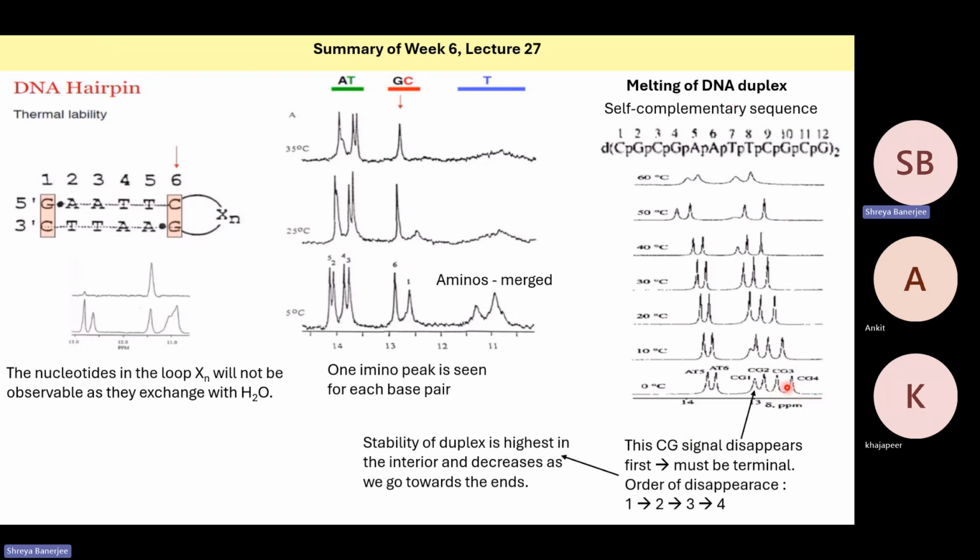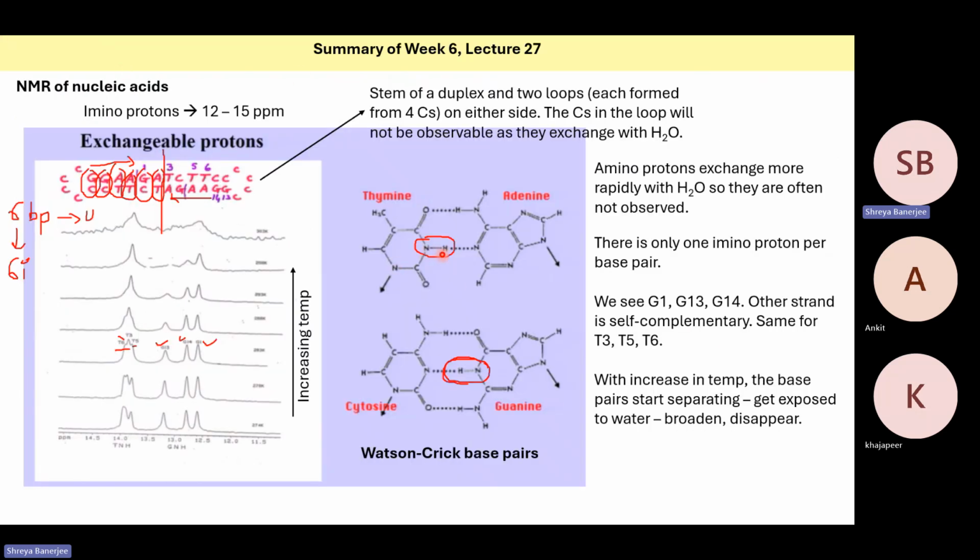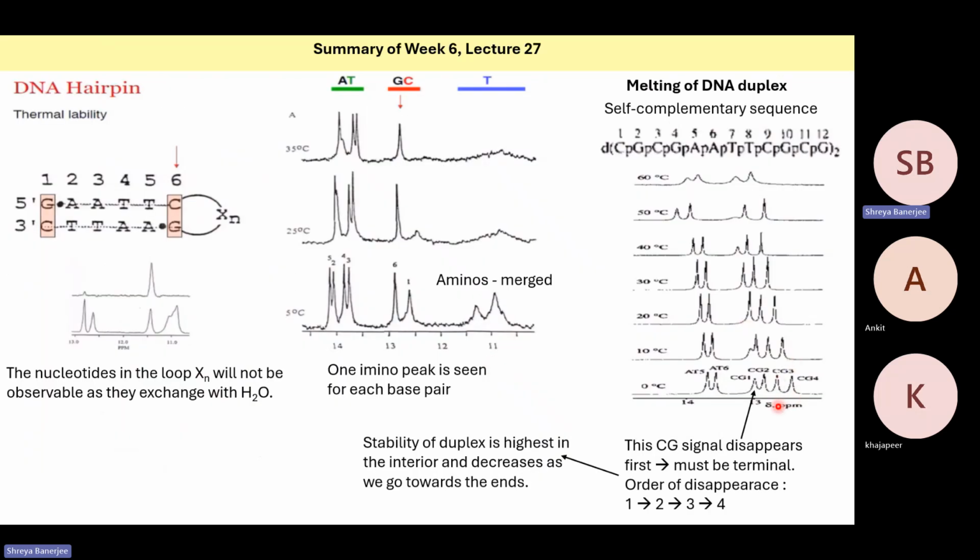So this is what is shown here again. Sorry, this is of another sequence. Now, as the temperature is increasing, the base pairs start to separate because of breaking of the hydrogen bonds. And so the iminoprotons in the base pair will get exposed to the solvent and the signal will start disappearing. So that is what is happening here.